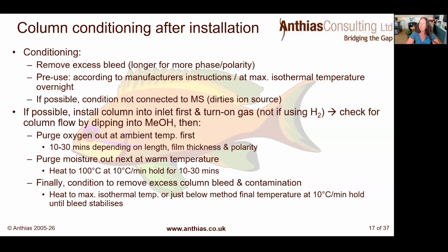Hold it then until the bleed stabilizes. What you'll see is it goes up and it goes down, and then it will start to stabilize, and that's when we can stop it. Which is why, again, connected to an FID, you can have that running and see where your bleed is at. Otherwise, I usually hold it for an hour.